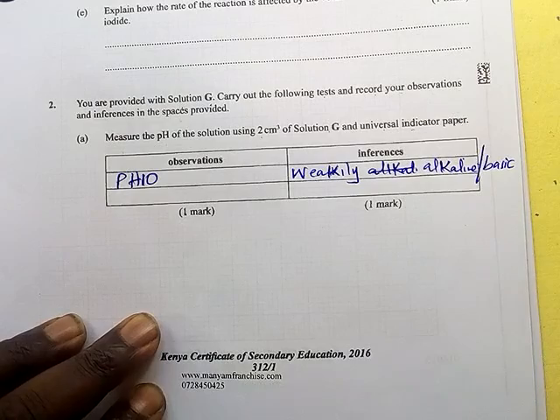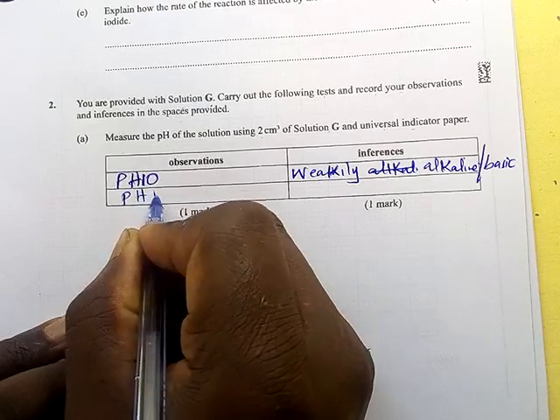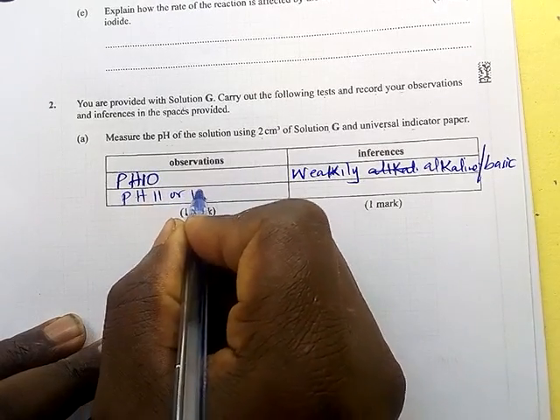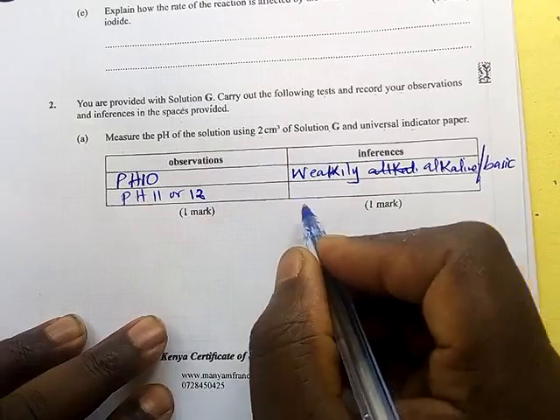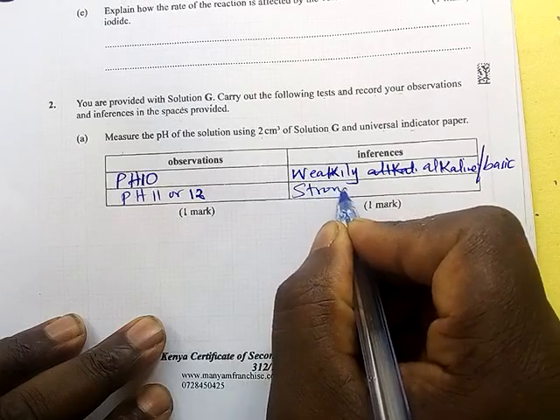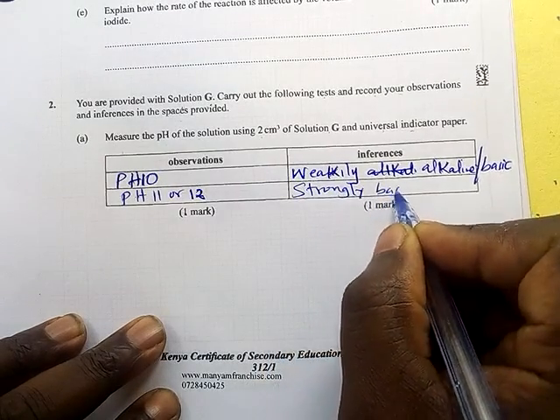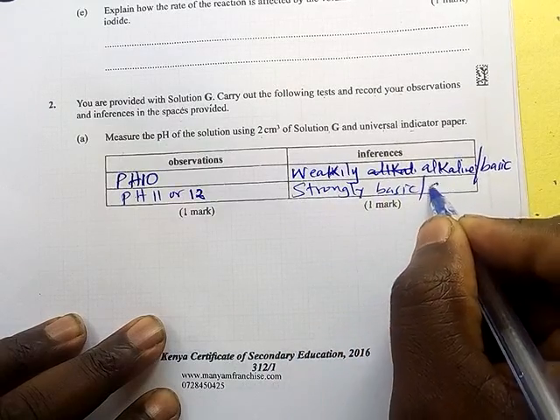Weakly basic. Others got a pH of 11 or 12. Both of them, they were supposed to score if they wrote a correct inference, that is, strongly basic or strongly alkaline.